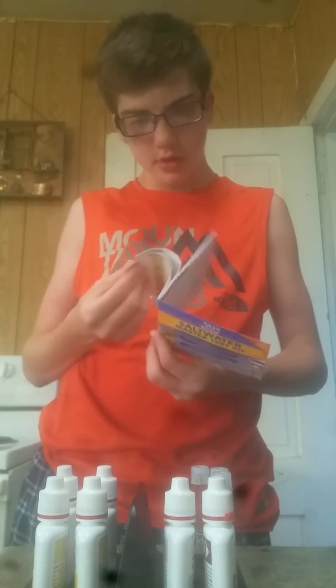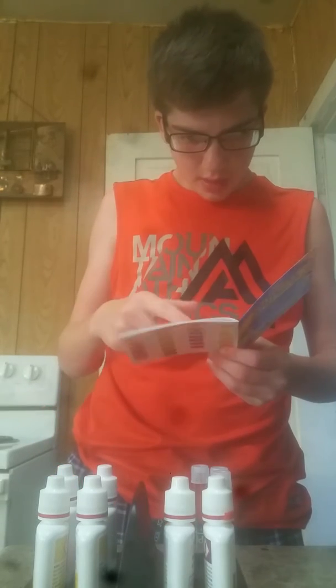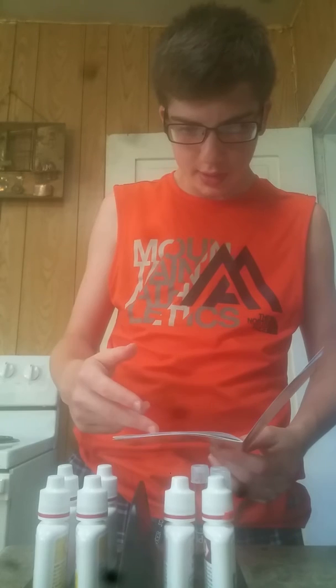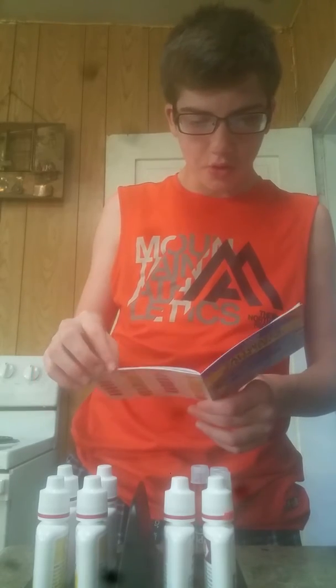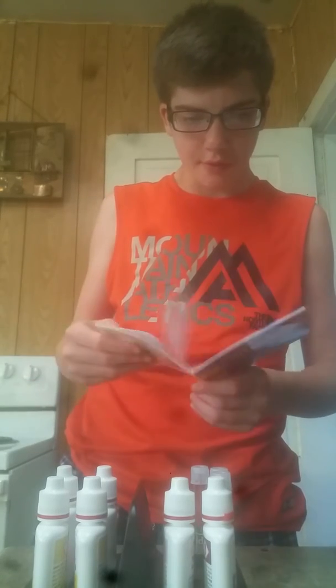It gives instructions in English, French, and Spanish. There's a high range pH test section, why to test pH, testing tips, directions, and recommendation of the levels. They do that whole setup for ammonia as well — they tell you how to reduce some things and add some things. They do that for nitrate and nitrite, and then it goes into the Spanish section.